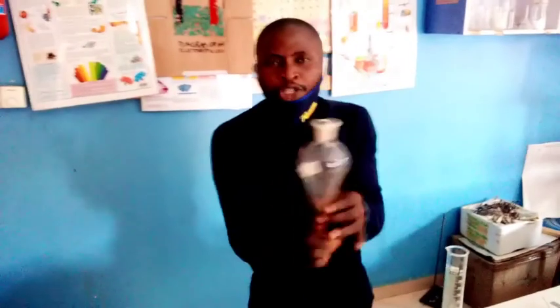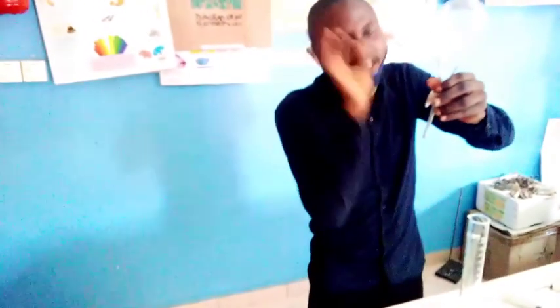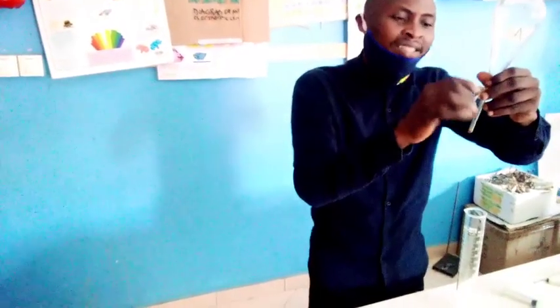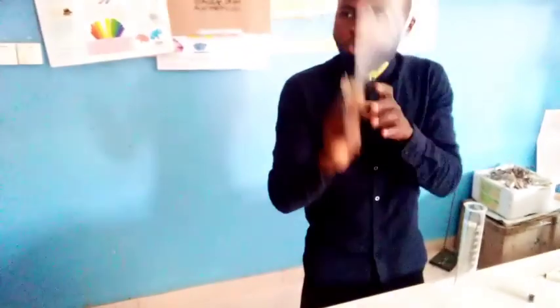What is the mode of operation? The two immiscible liquids will be poured into this separating funnel. The liquid of higher density will come down and the liquid of lower density will float on top of it. Thereafter, when it has settled, you open this tap so that the one of higher density can come out. Immediately the last drop of the liquid with higher density is out, you close it. Thereby, you have separated the immiscible liquids from each other. So the purpose is extraction. You have extracted one liquid from the other, and you have also separated the liquids from each other.